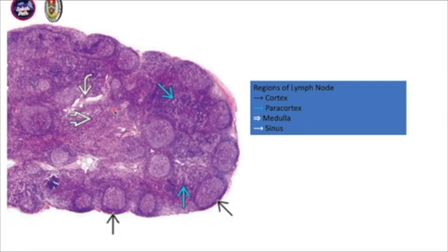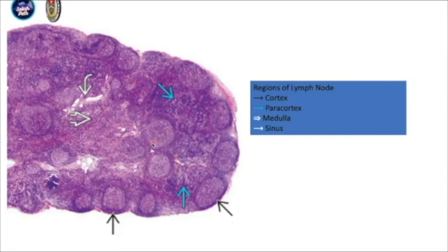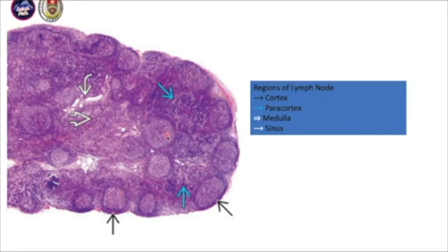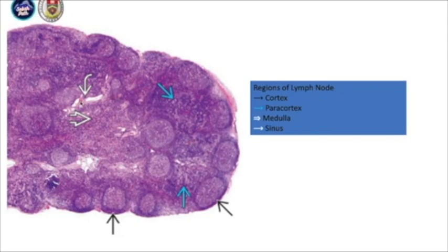This is how a benign lymph node looks like at low magnification. You can see there are lymphoid follicles with a prominent germinal center rimmed by a well-defined mantle zone. This is the cortex region. In between the cortex, the lymphoid follicles and mantle zone, you have the paracortex region, which is composed of T lymphocytes and plasma cells. Then you have the sinuses and the medullary region.